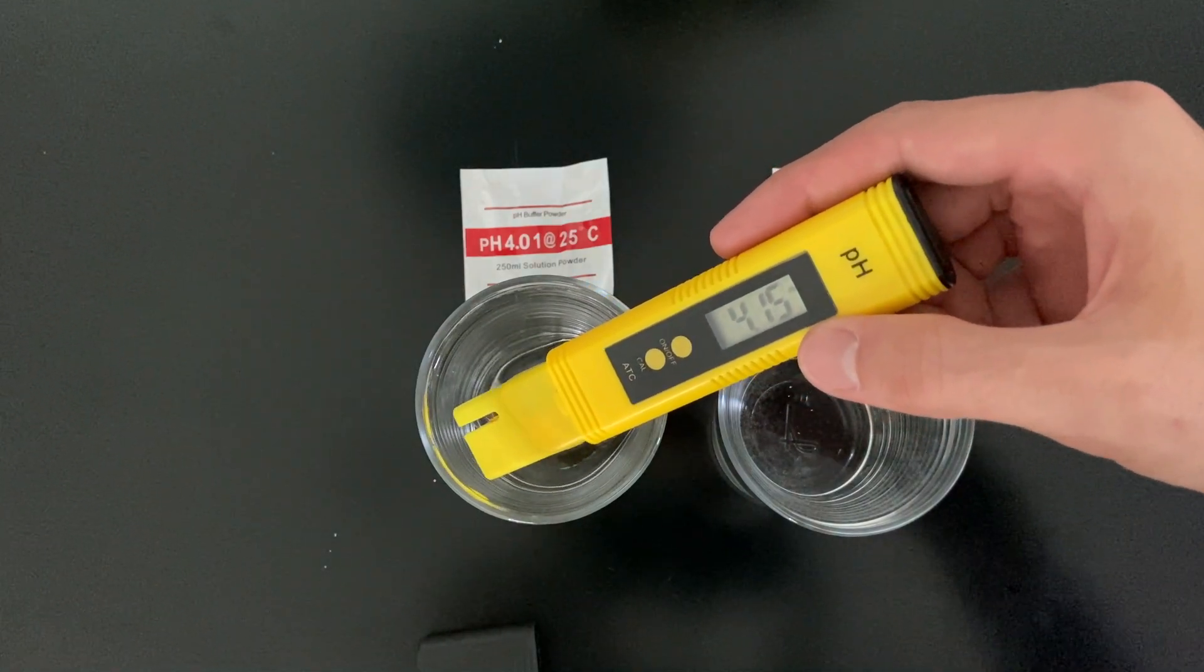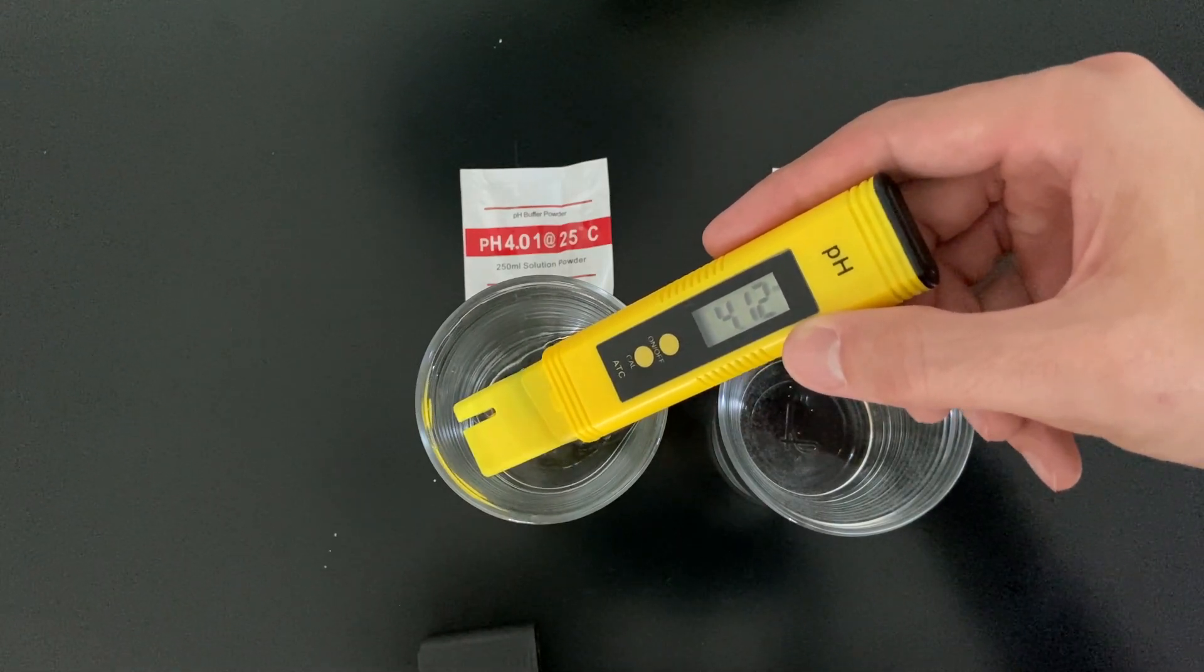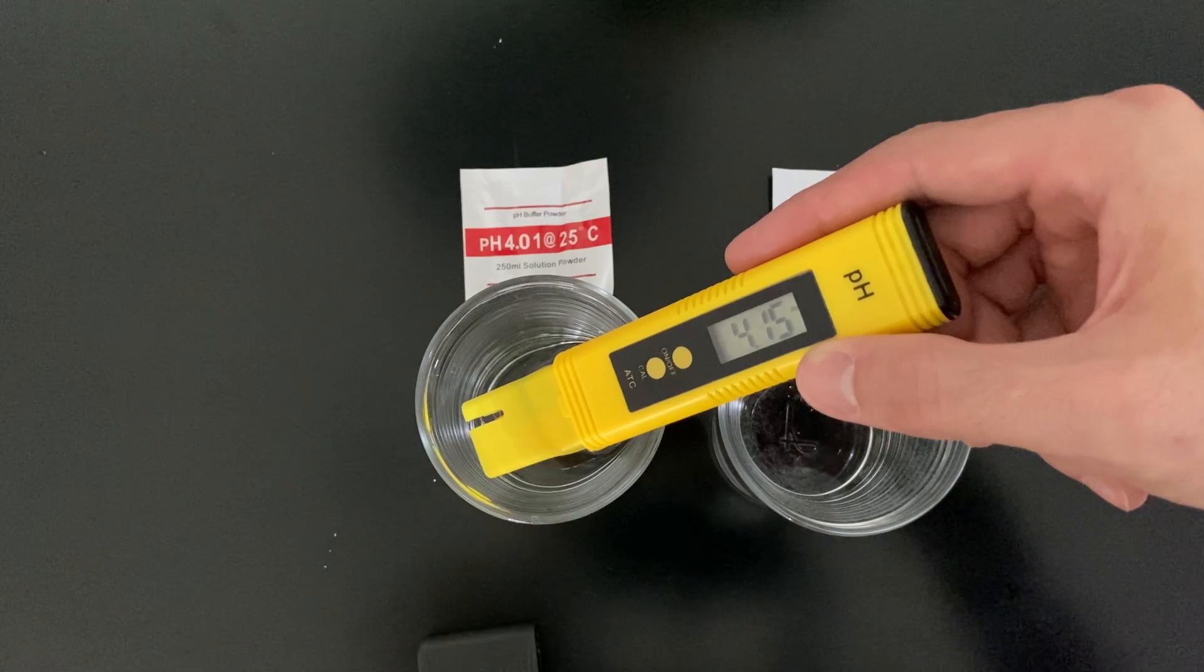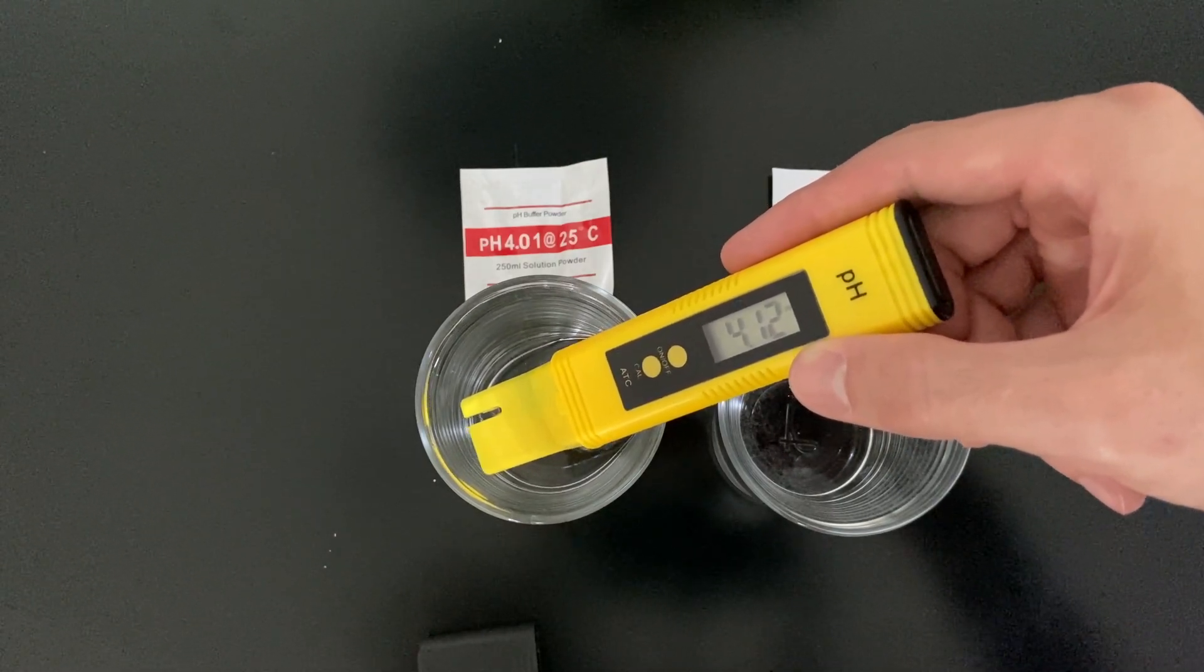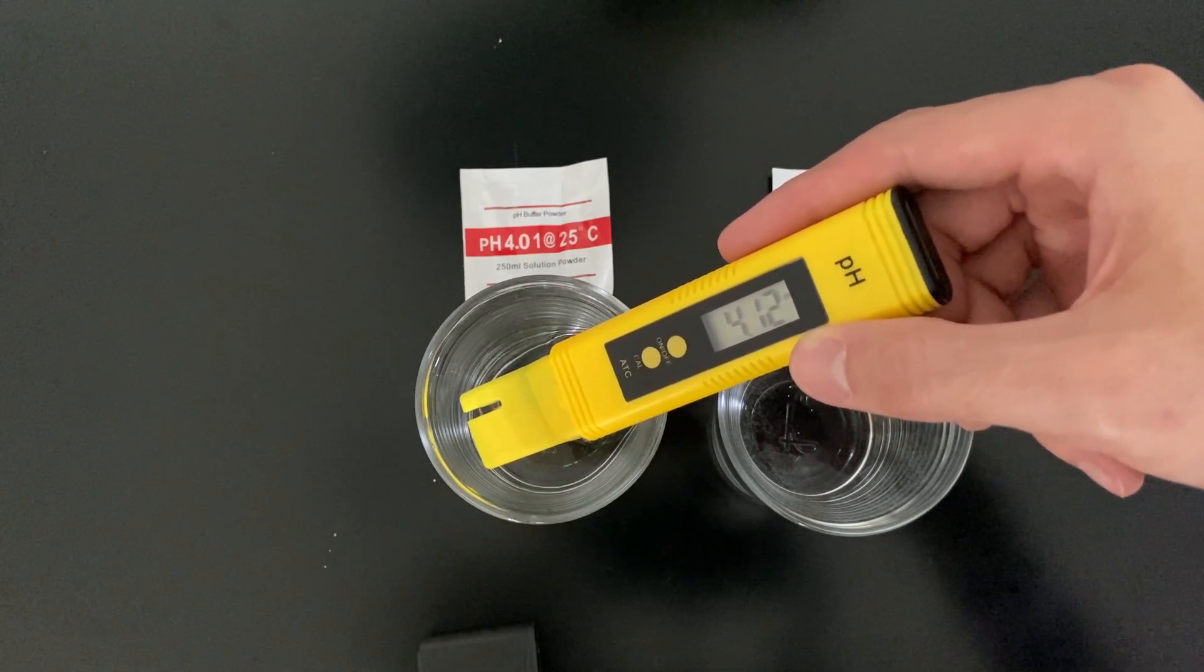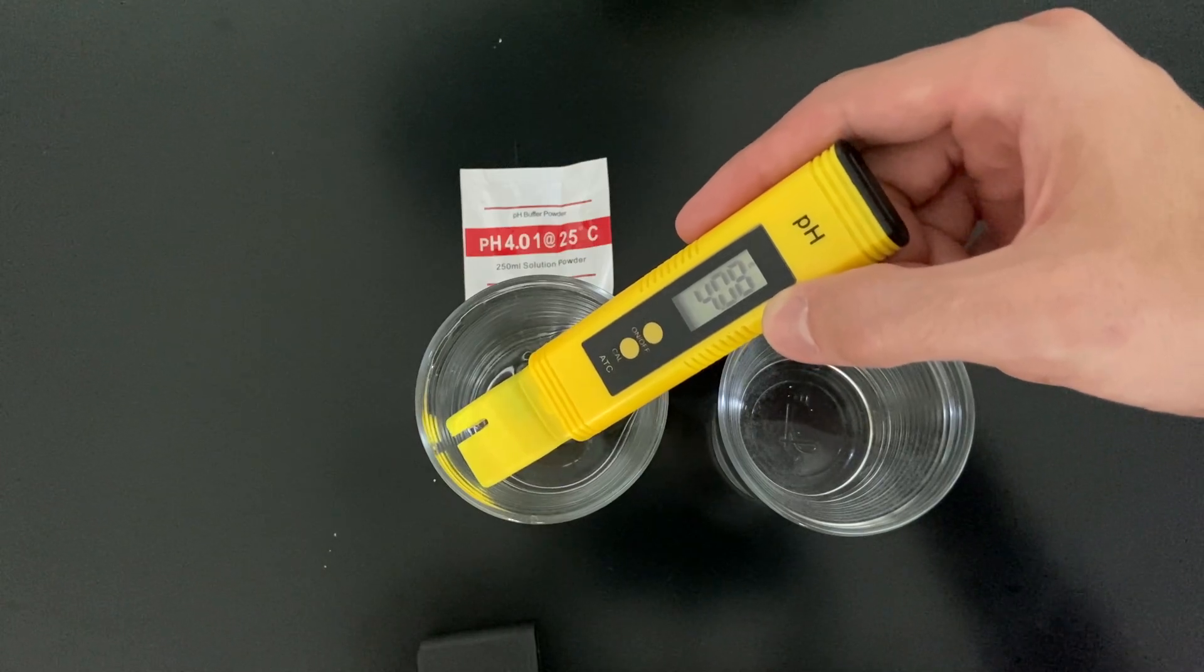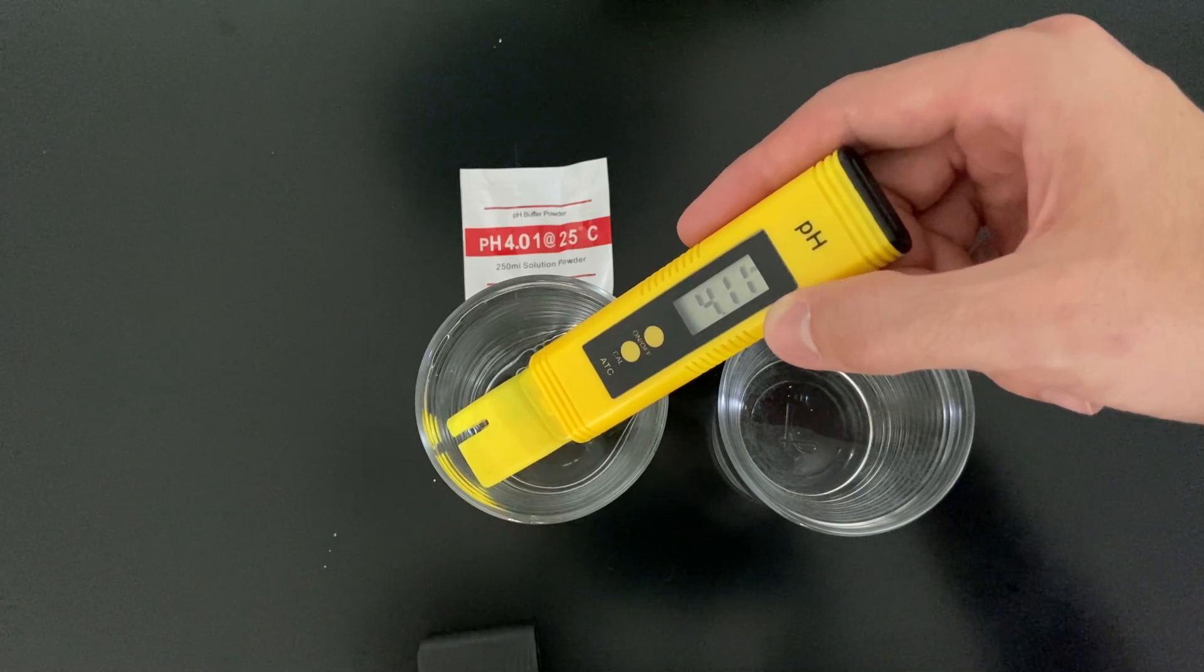Here we can see it's 4.15. The 4.01 powder is what we use to calibrate it, so it's really close. The accuracy of this instrument is ±0.01. Now it's showing 4.08, 4.11, so it's very close to the set value.